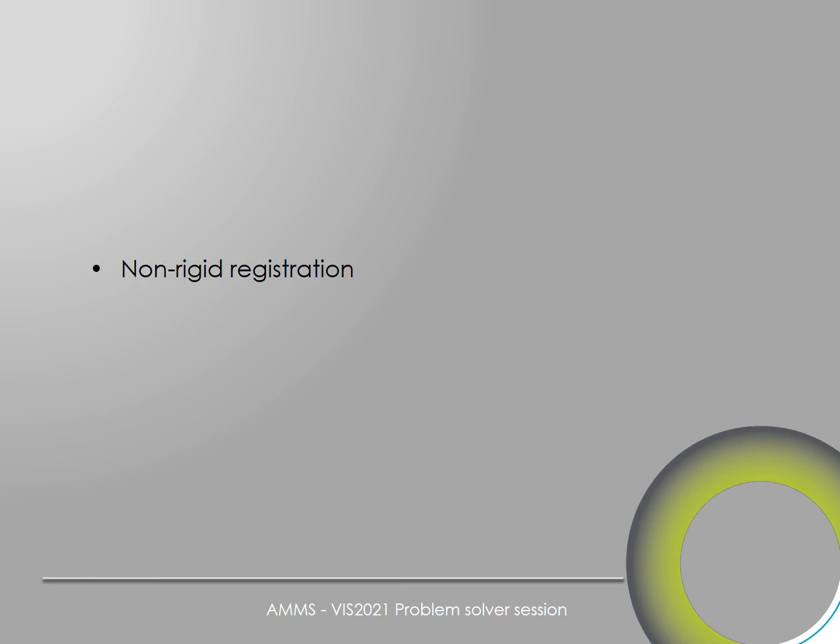So that's one of the key questions, and eC-CLEM always comes with interpolation in both directions. We always match the pixel size of the final image. That's something we decided at the beginning of the project, and this is now a permanent situation. It might evolve in the future, we might see.